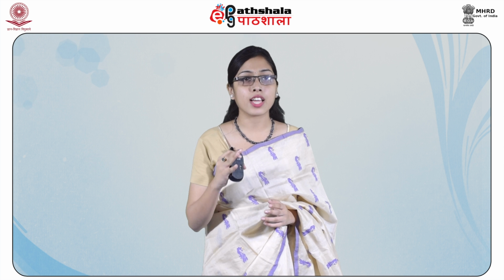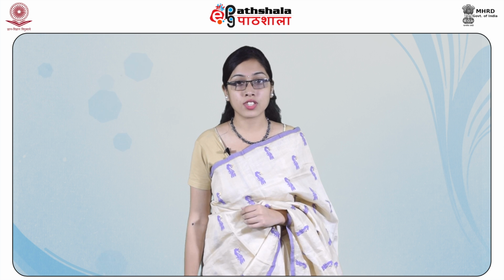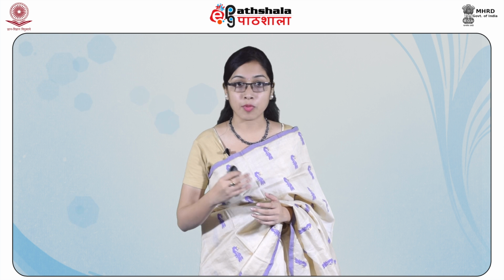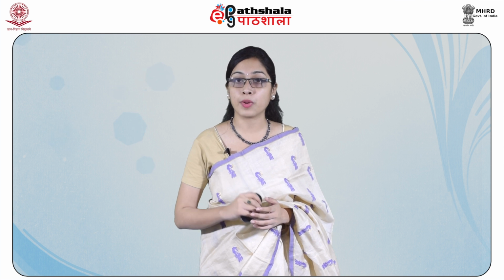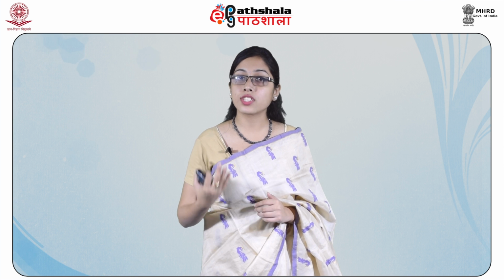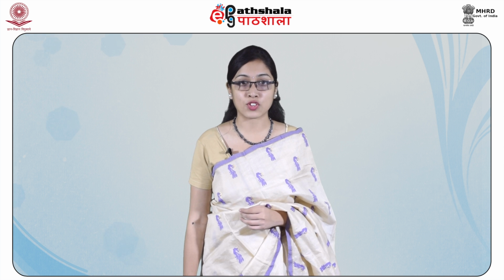The stationary phase in the case of column chromatography is held within a narrow tube via which the mobile phase moves through either by gravity or by pressure. Column chromatography can be further differentiated based on the types of stationary and mobile phases and the kinds of equilibria involved in solute transfers between the two phases. There are several classes of column chromatography such as gas chromatography, high performance liquid chromatography also known as HPLC, etc.